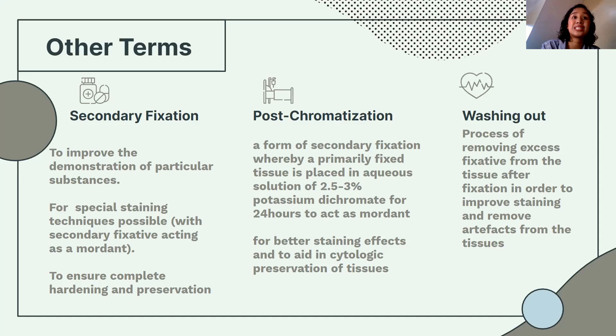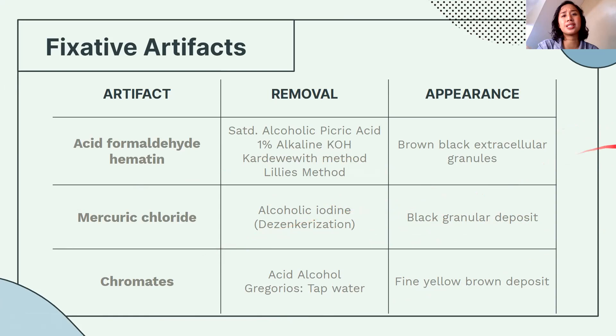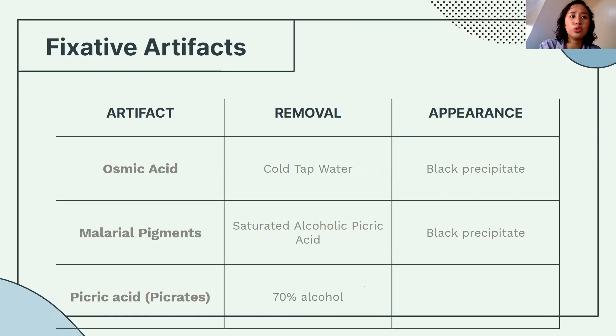Finally, these are fixative artifacts — please take note of them. We also have the term dezinckerization, which is the removal of the black granular deposit using alcoholic iodine. How to remove various artifacts: osmic acid pigments, malarial pigments, and picric acid artifacts all have specific removal methods.